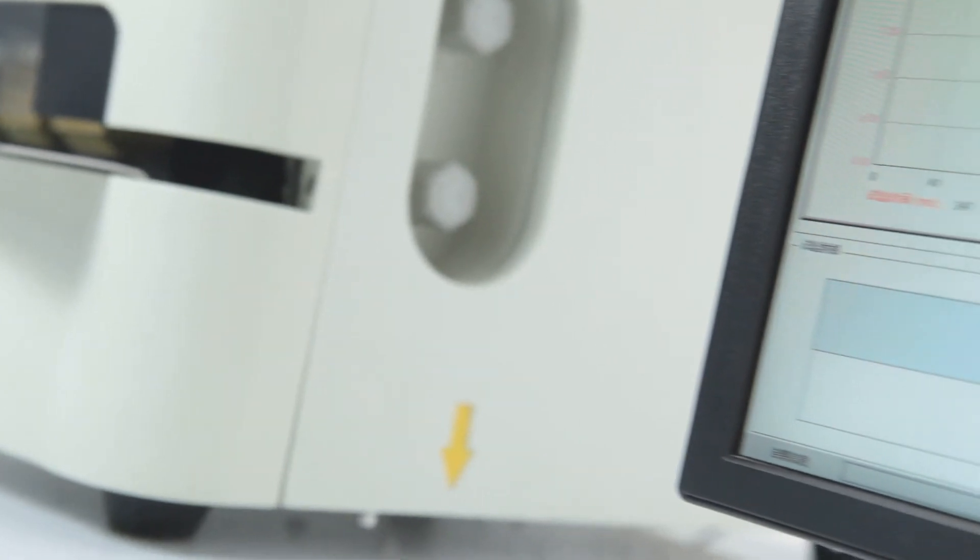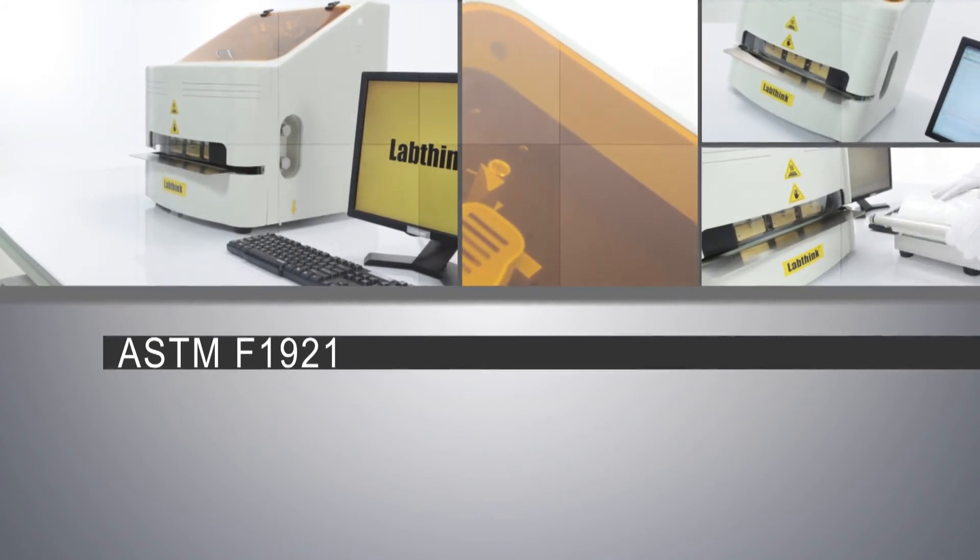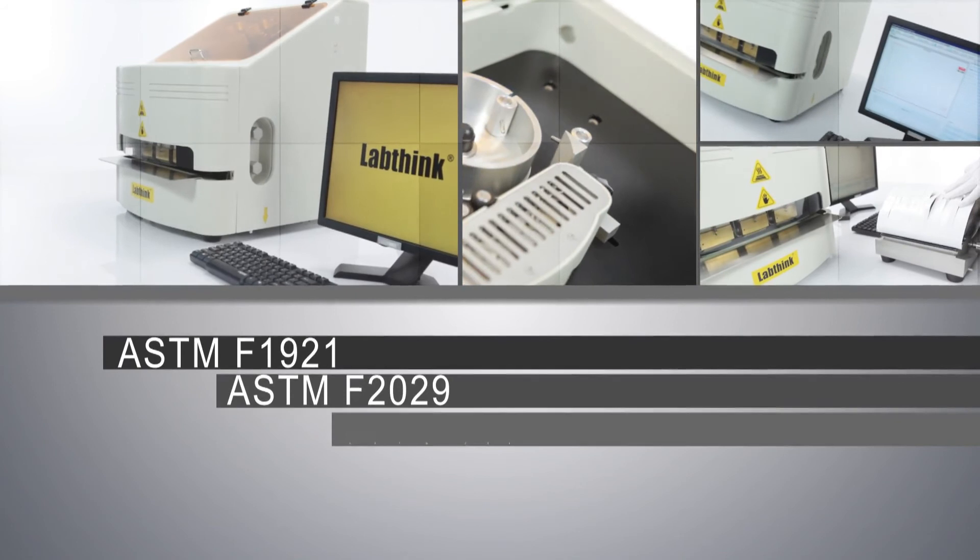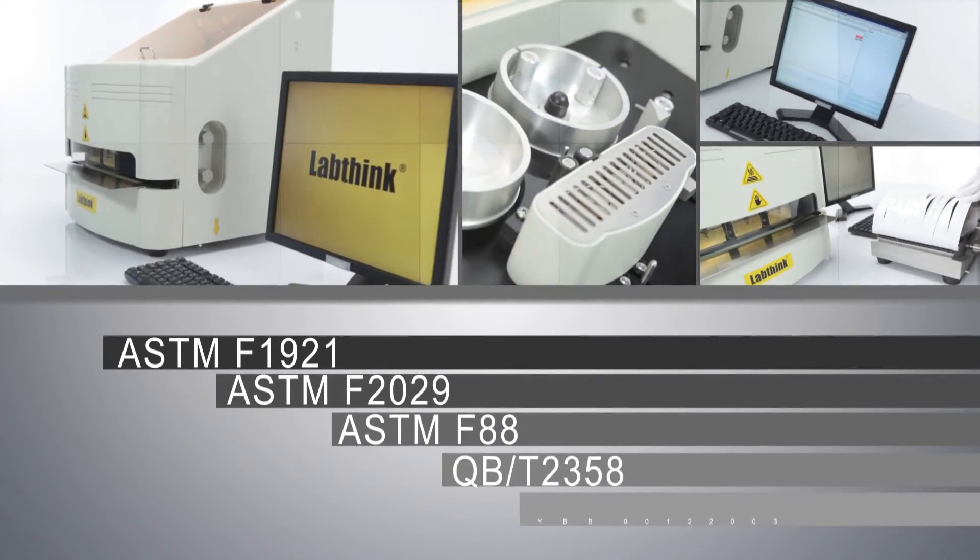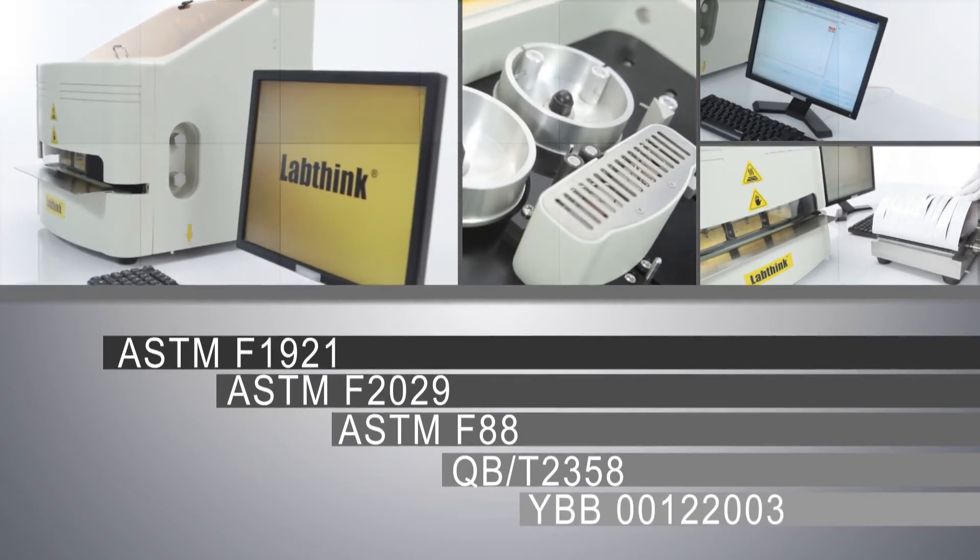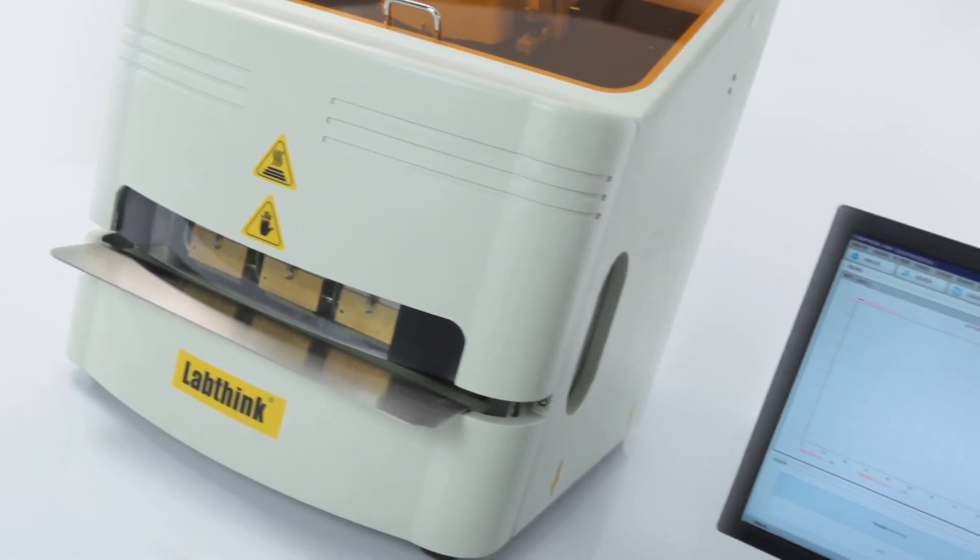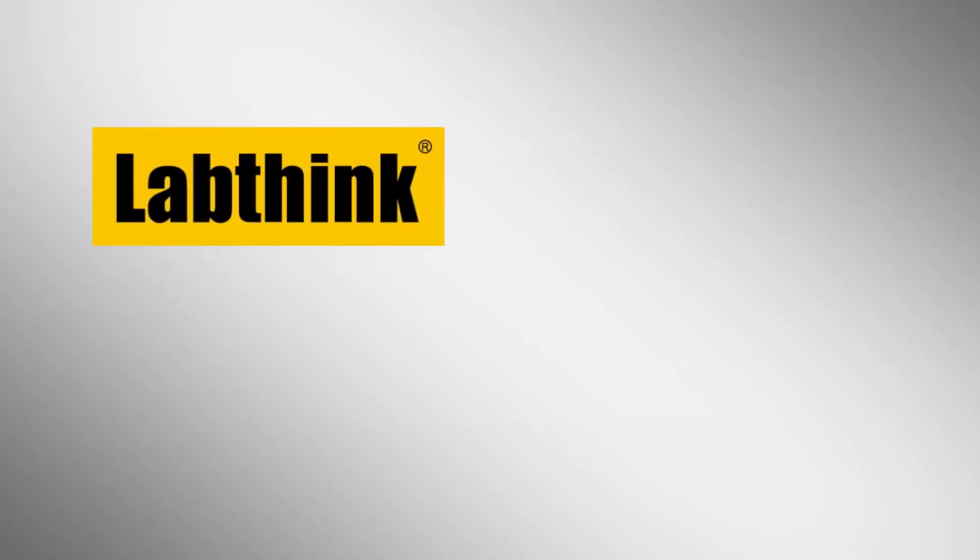i-Thermotech 2400 conforms to multiple Chinese and international standards including ASTM F1921, ASTM F2029, ASTM F88, QB/T 2358, and YBB 00122003, which is ideal for heat seal and hot tack tests for laboratories. LabThink, think for you only.